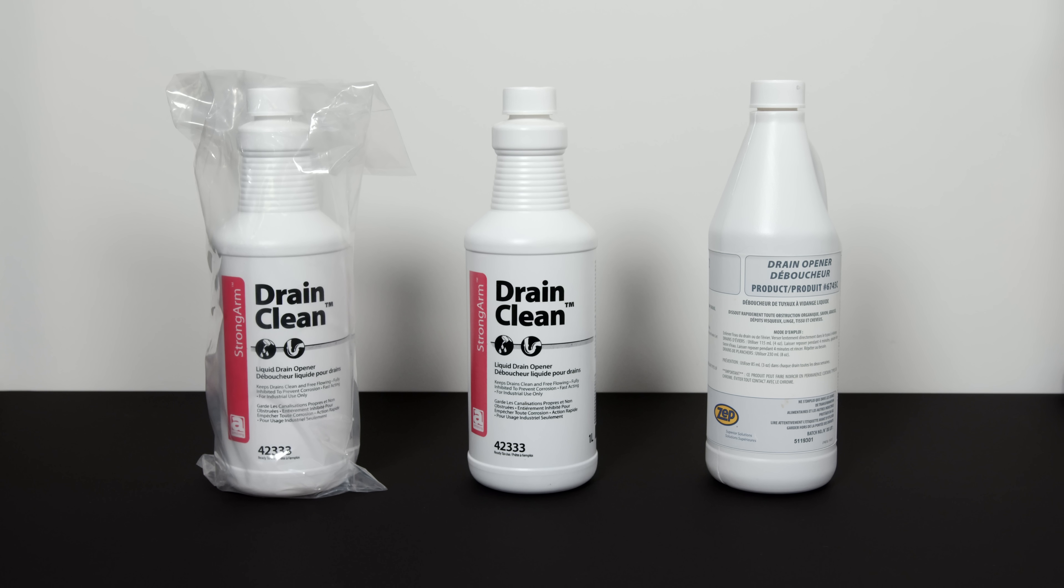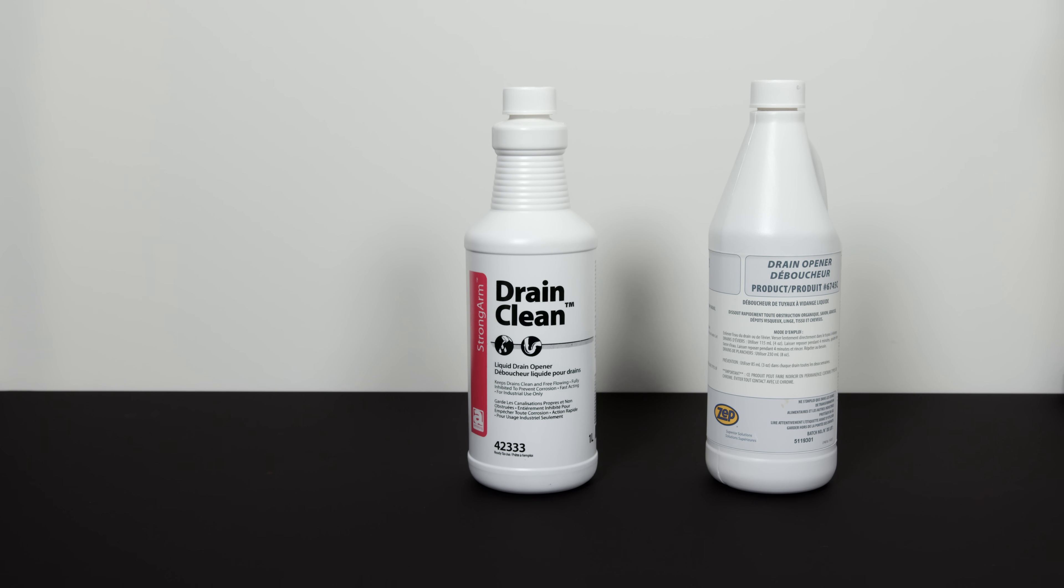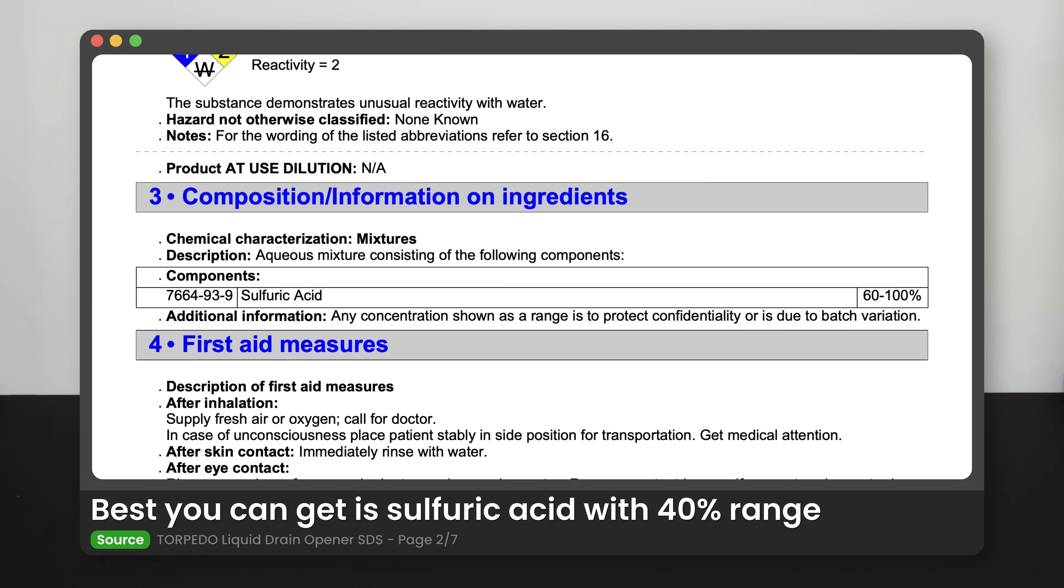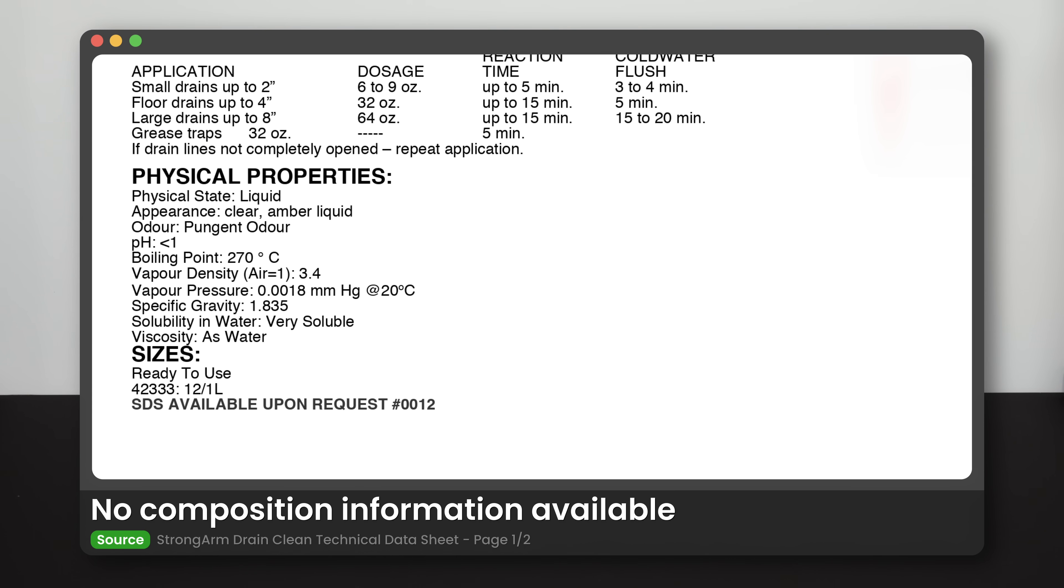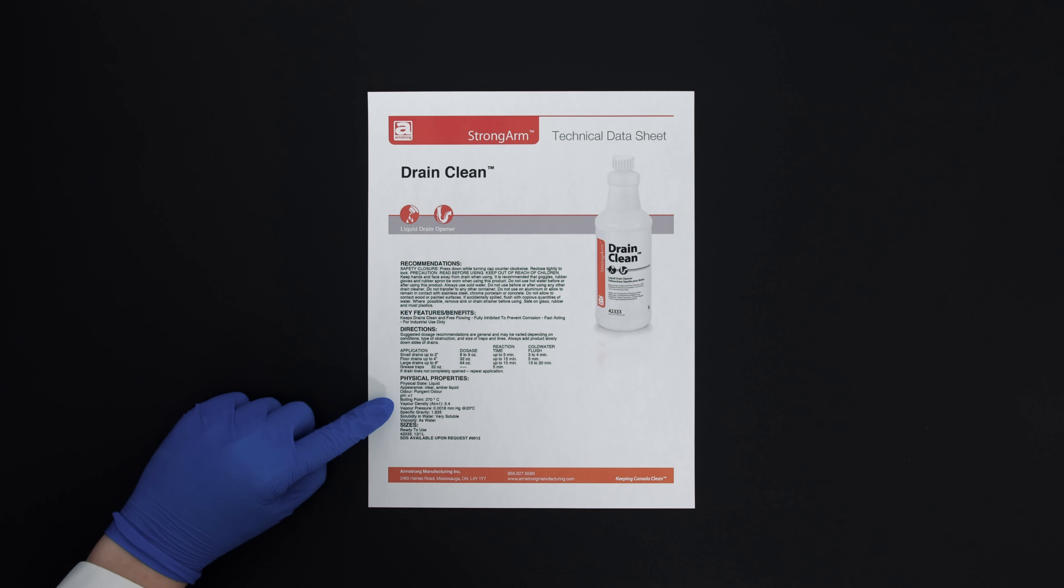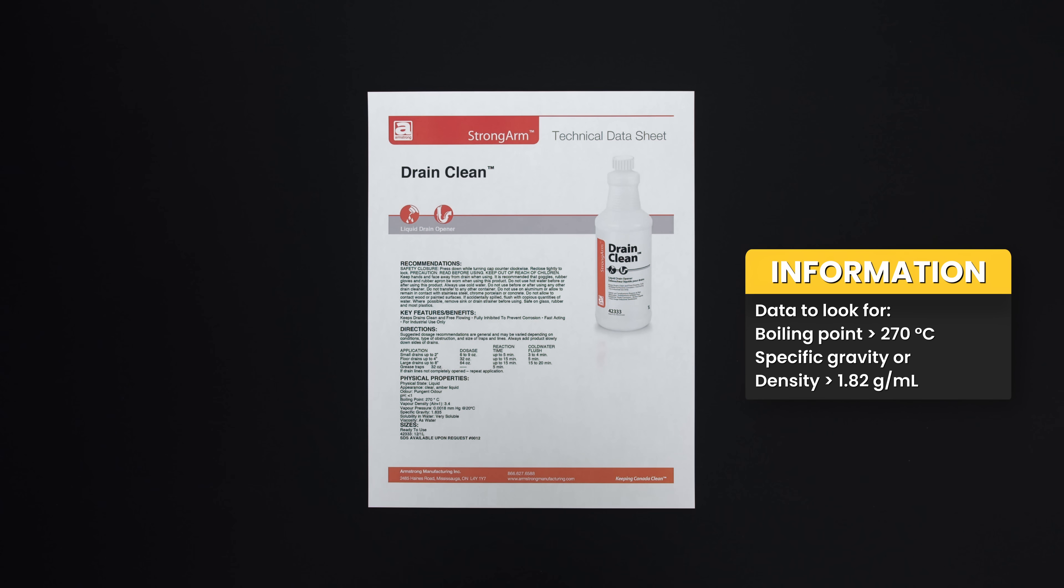But we are scientists, right? You can't just rely on a name or external appearance to assume it contains sulfuric acid. We need to verify it through its MSDS. The MSDS provided by the manufacturer are often quite shady. I've come across many of them that don't list the exact chemicals. But as you can see from the boiling points and the specific gravity, it is aligned with sulfuric acid boiling point charts almost perfectly. And that's the solid evidence that it contains sulfuric acid.